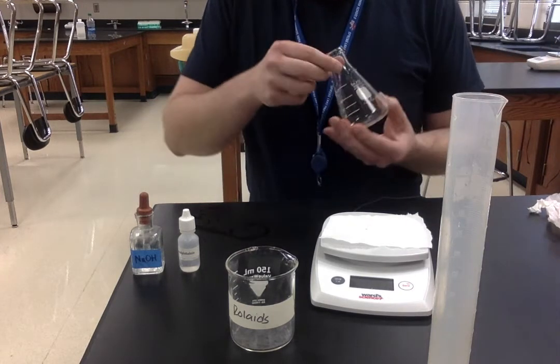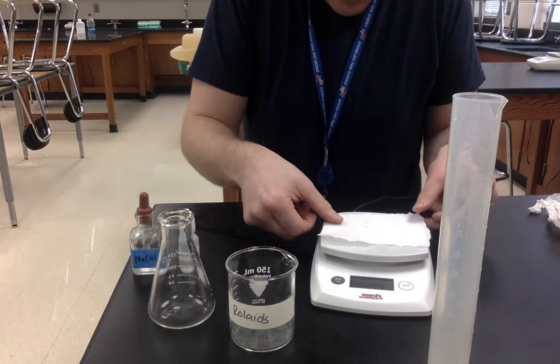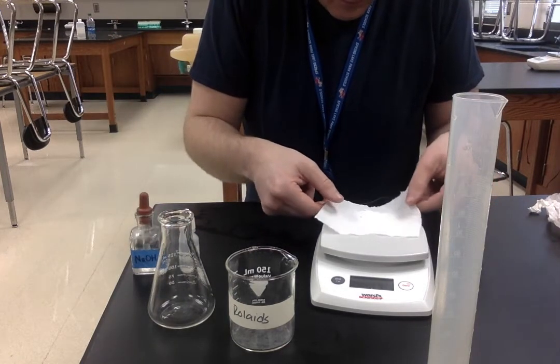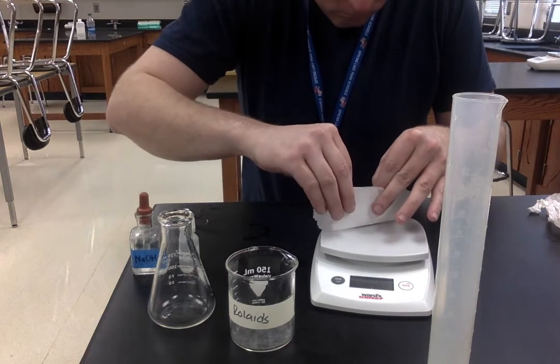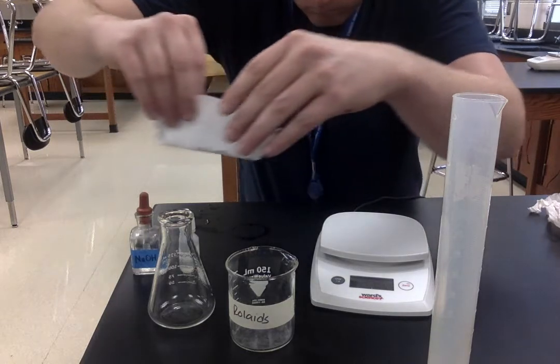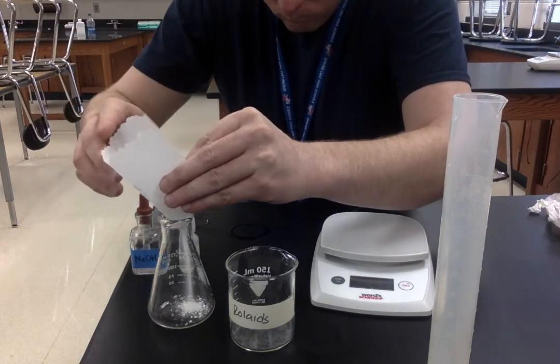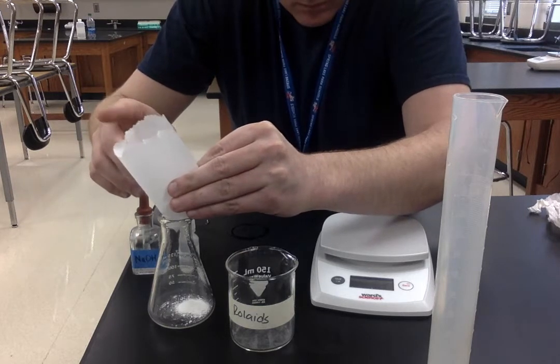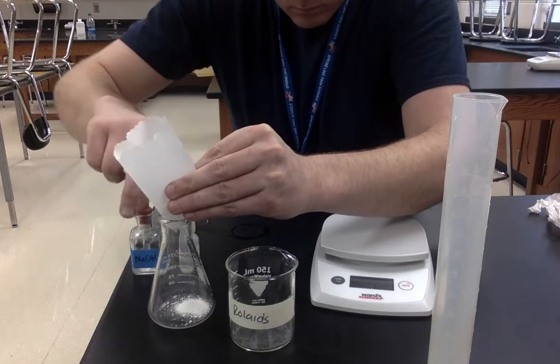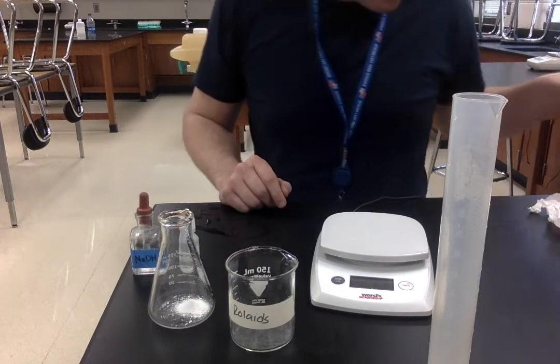Next I'm going to take my Erlenmeyer flask and add the powder to it. I got as much in there as we could.